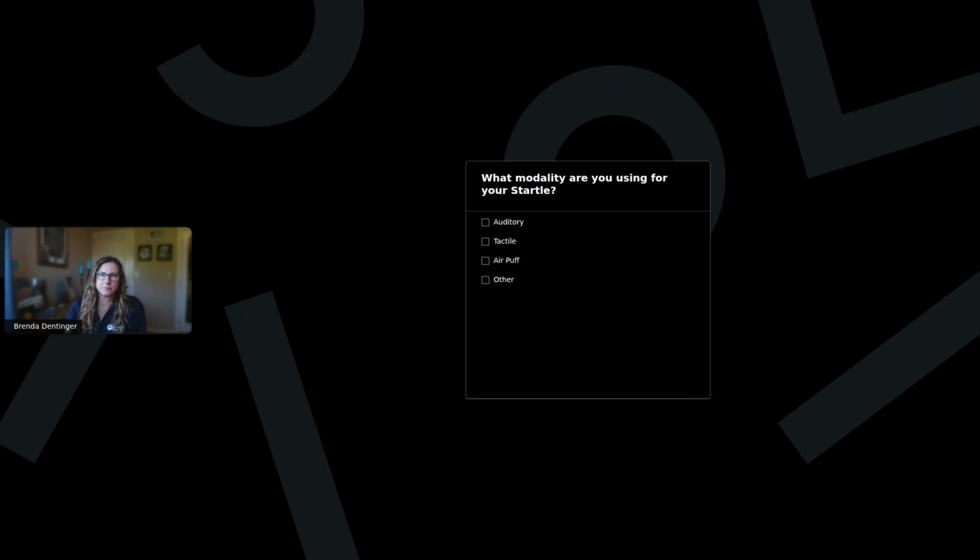You'd probably just have to adjust your inter-trial interval to give the subject a bit longer to return to kind of normal stasis before presenting the next series of pulses.